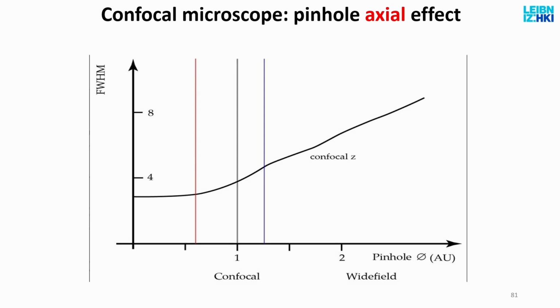So the question here was about super resolution microscopy, especially STED microscopy. With STED microscopy, those of you who learned about it, you replace the solid spot with which you illuminate with a donut, which is a combination of two lasers. The idea is that you have a high energy laser which illuminates in the shape of a ring, and then you use your regular fluorescence laser focused in the center of this ring. So it looks like a donut in the middle of which there is sitting a little button.